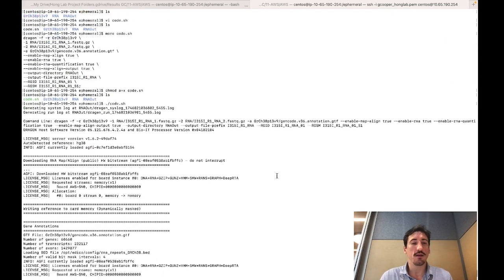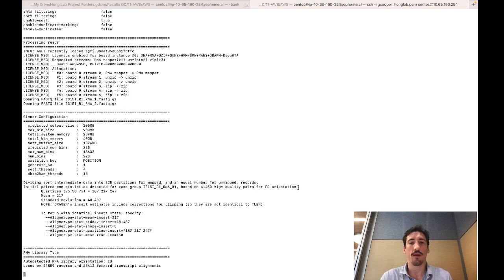Very fancy. And so interestingly, when you normally align a file, it actually takes sometimes hours if you're using a traditional aligner like BWA. But as you can see, and we'll see, that this takes only maybe 1 or 2 minutes, which is so much incredibly faster and helpful when you're processing many, many samples.